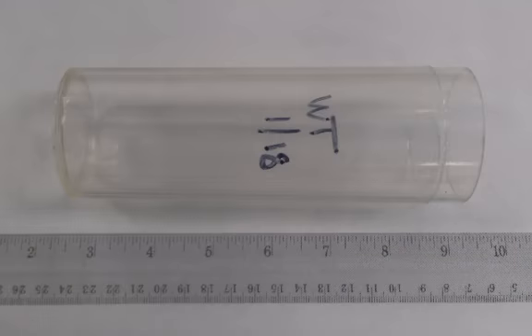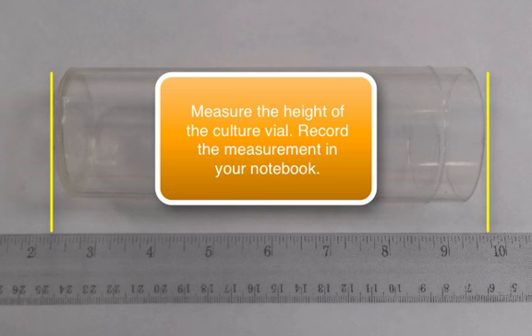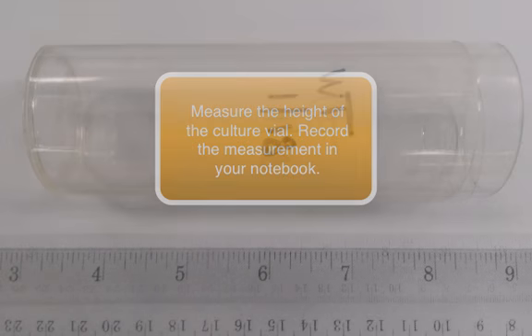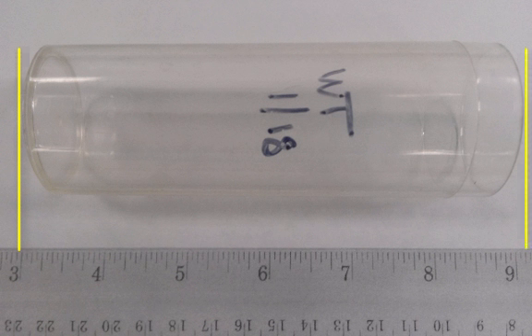Let's take that same culture vial and lay it on its side. This will make it a lot easier to make the measurement. Notice two lines are going to appear on the screen. Use those two lines and the ruler shown on the screen to make a measurement of the height of the culture vial.